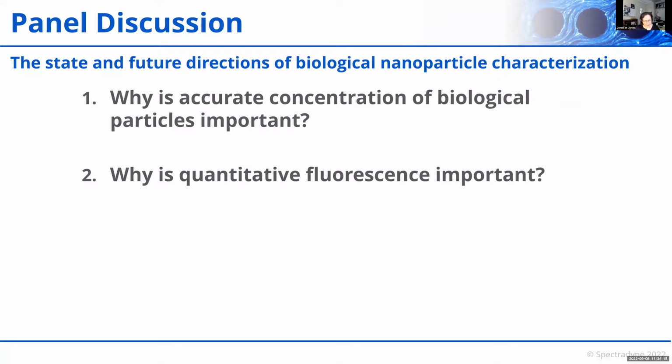So I think the opportunities for doing gated analyses within this is going to be exciting as a first step in exploring the heterogeneity.